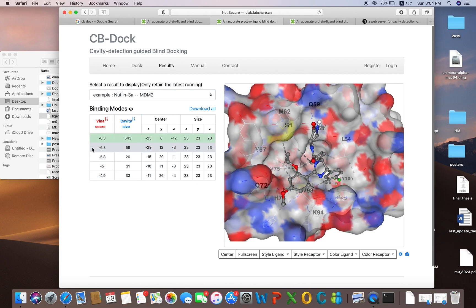These are the five cavities. You will have to select the appropriate one, but it is very important that the scoring function alone will not decide whether that is a good binder or not. You will have to read the literature to find where the binding site is and which residues are important for binding. For example, if methionine 62 is important for the mechanism and must be inhibited, you will check whether your ligand makes a strong interaction with methionine 62.